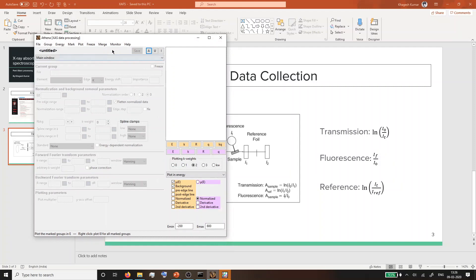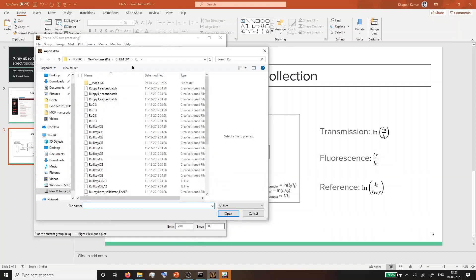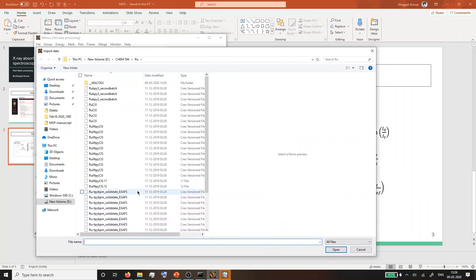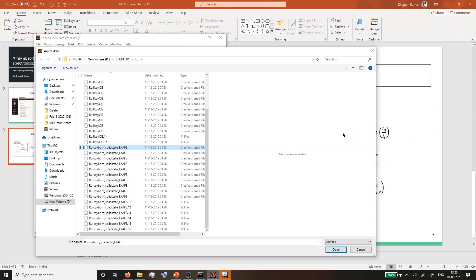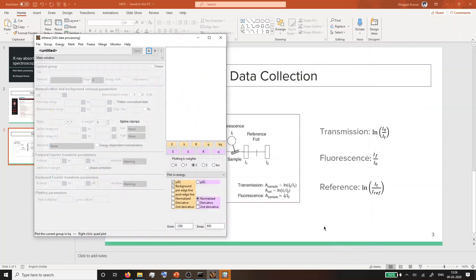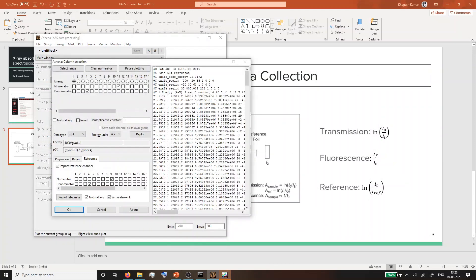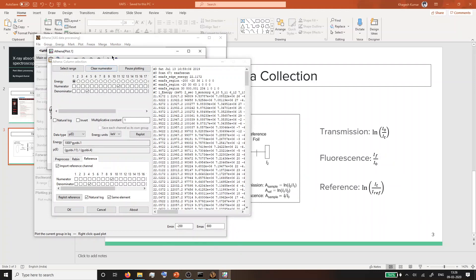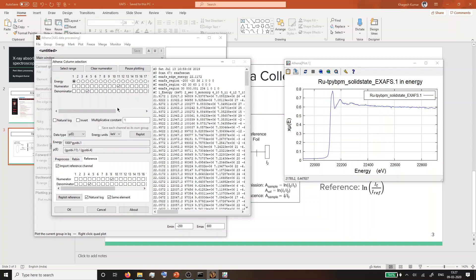Now we can move on to basic data processing. This is the Athena software and the usual interface. Import data and you will go into the directory of your file. You can import multiple files at the same time as long as the detector arrangement for all of them are the same. These were all collected one after the other, so I can open them all at the same time. Once you open it, this window will open and ask you to select the channels you want to open.